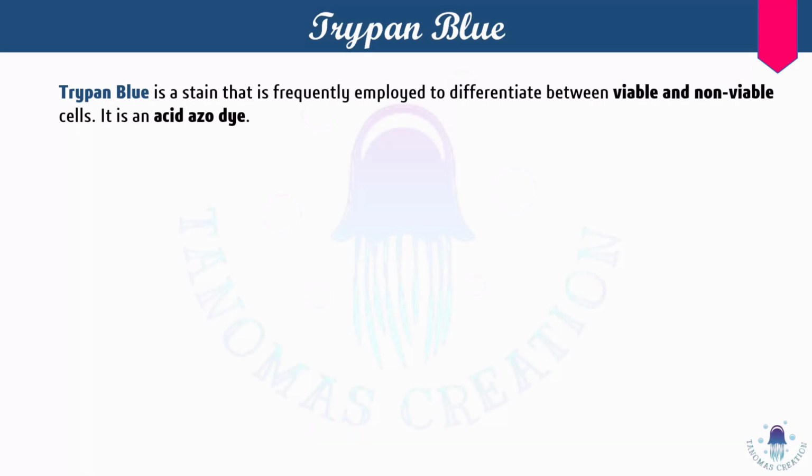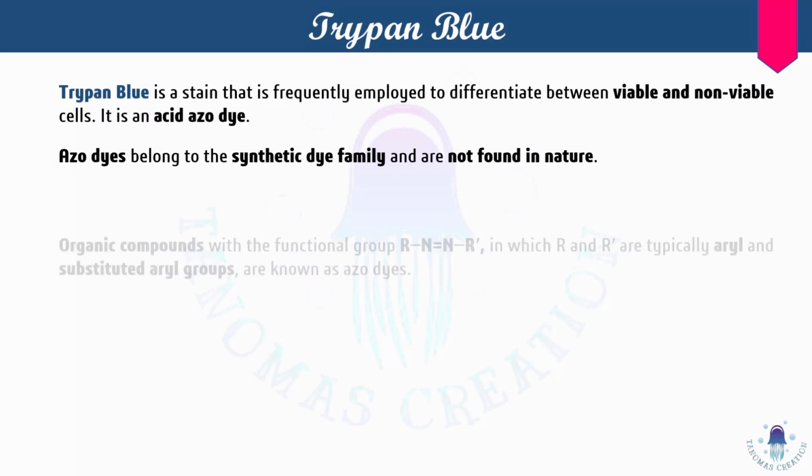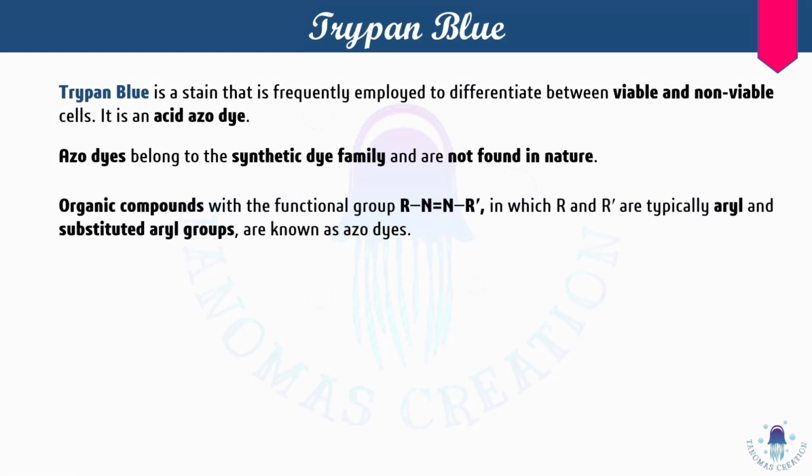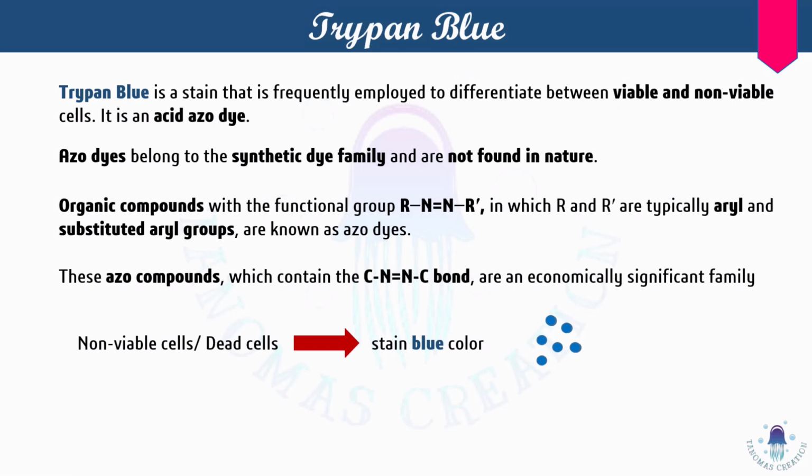Now it is a type of acid azo dye and it belongs to the synthetic dye family, and they are not found in nature obviously. So why are they called azo dyes? Because they are organic compounds which have the functional group R-N=N-R', where R and R' are aryl and substituted aryl groups respectively. That is why they are called azo dyes. And since they have this bond, they are very economic and very widely employed for this viability check purpose. Now this Trypan blue stains the dead cell in blue color.